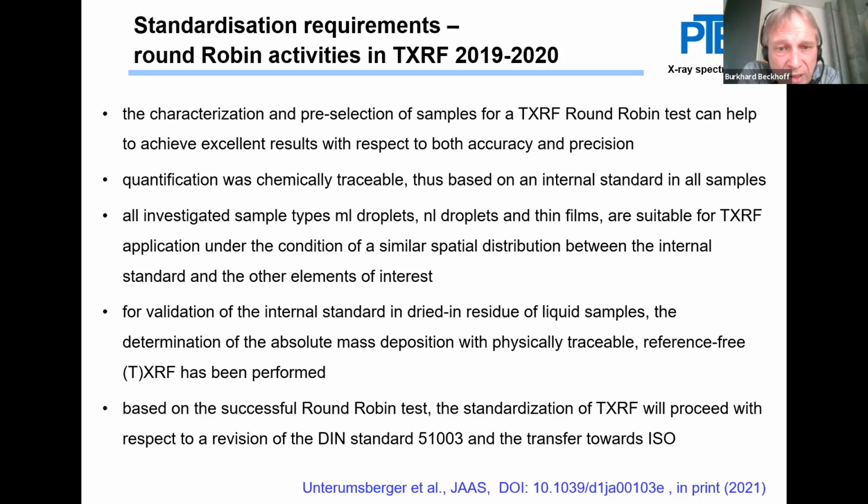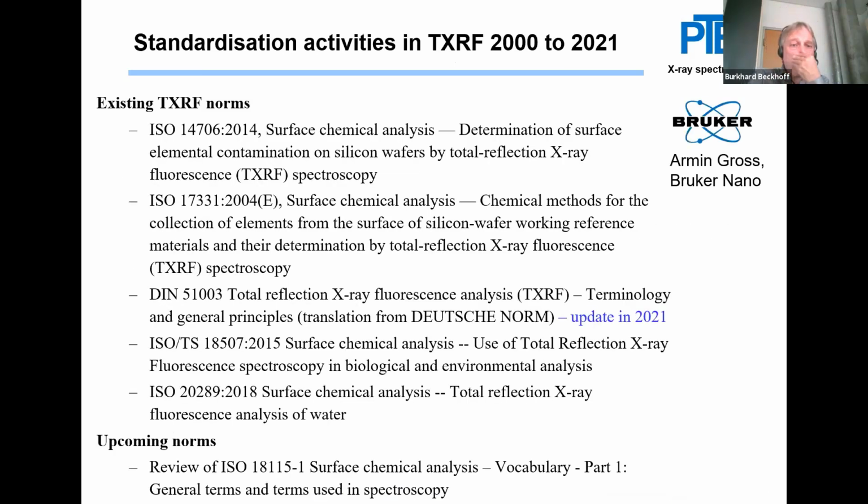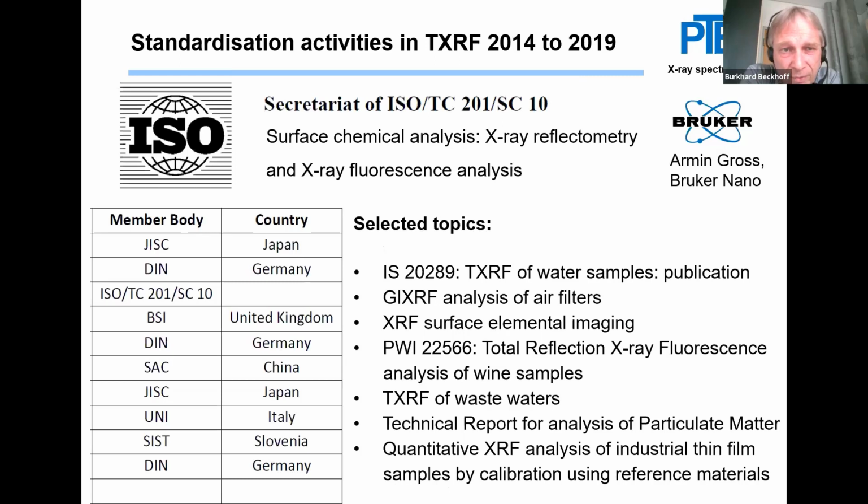The corresponding German norm or regulation has been updated based on these findings, and we're currently in the process of forwarding this information, the suggestion, to the international works. This is a slide that I got from collaborator Armin Groß, colleague of Hagen Stößner at Bruker Nano, regarding the TXRF norms.